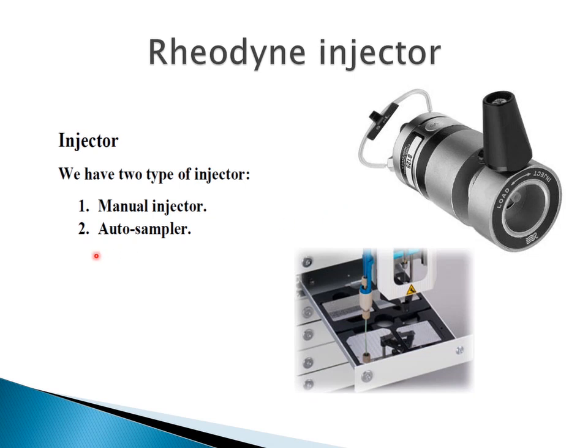The autosampler more or less has the same idea, but by using certain robots.